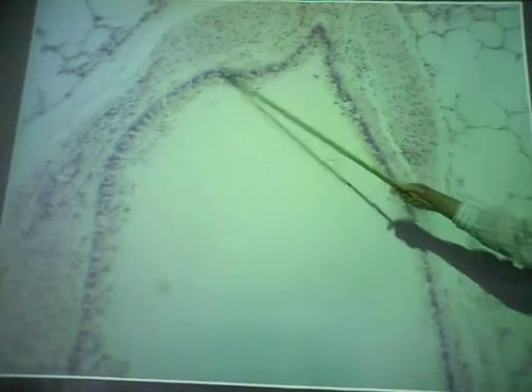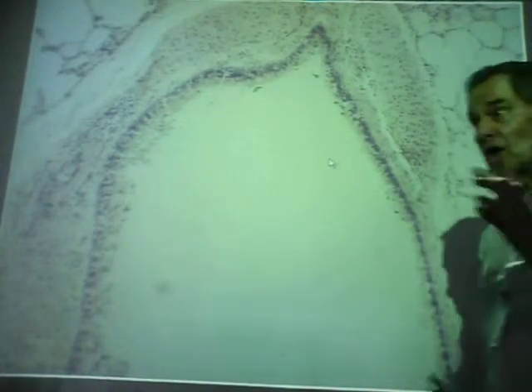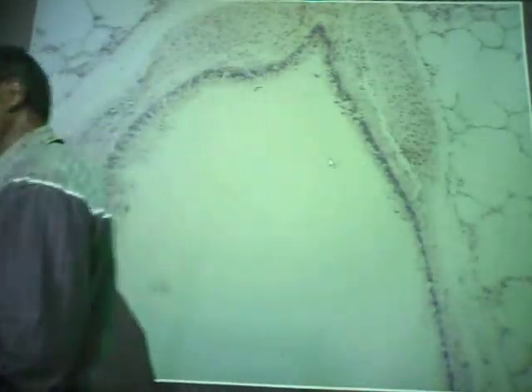Okay. How about this thing right here? What is it? That's a tertiary bronchus. How do we know? Cartilage. Cartilage again, so another tertiary bronchus. So cartilage in the wall means tertiary bronchus, regardless of size or shape. No cartilage, then it's either a bronchiole, terminal bronchiole, or respiratory bronchiole. If it's got one or more alveoli, it's a respiratory bronchiole. And a terminal leads to a respiratory.